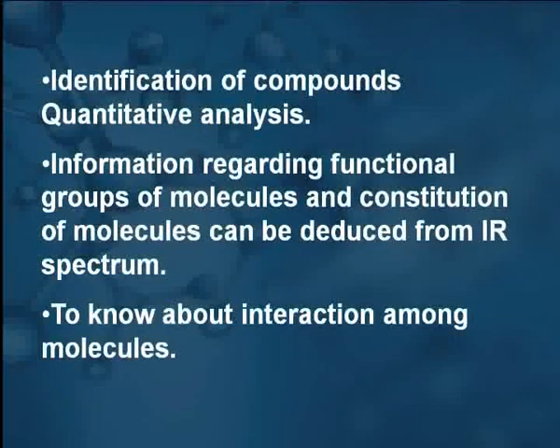Identification of compounds and quantitative analysis can be done by using IR spectroscopy. Functional group information present in the molecules, and the constitution of the molecule, can be deduced from the IR spectrum. The various peaks in the IR spectrum will give the information regarding the functional groups present in the molecule. We also know about the interaction among the molecules, how the molecules interact with each other, that we can record by using IR spectroscopy.